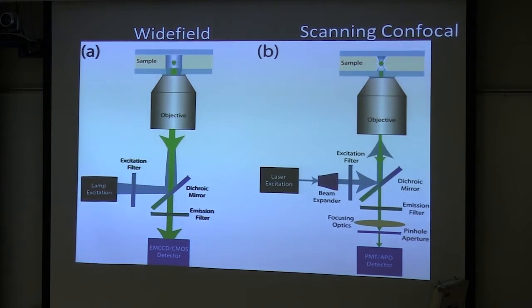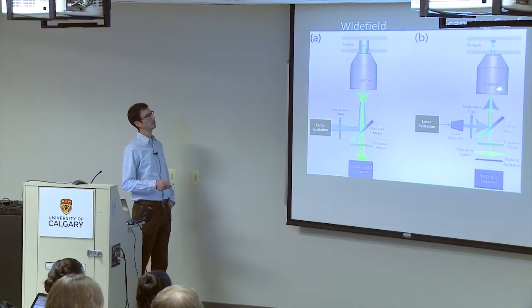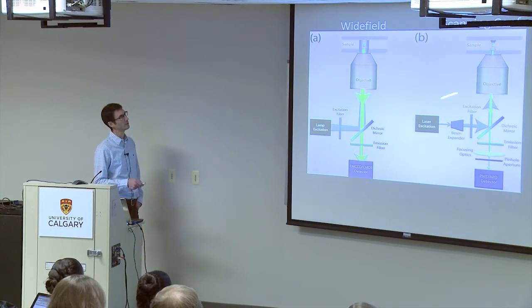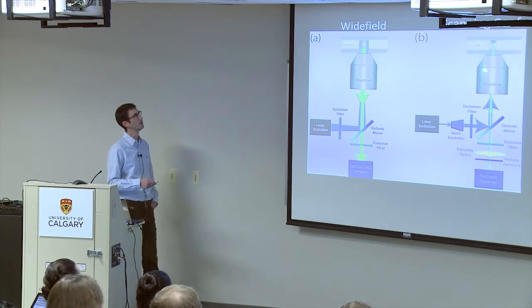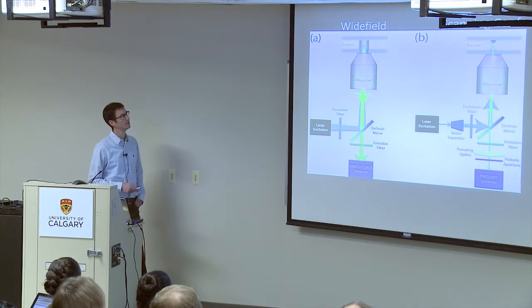And so the advent of the scanning confocal microscope changed this light path around a little bit in that our laser beam now, this is actually poorly drawn. It shouldn't be focused into the back of the objective here. It should actually fill the entire back of the objective. Which means you focus your excitation light into a single point in your sample.